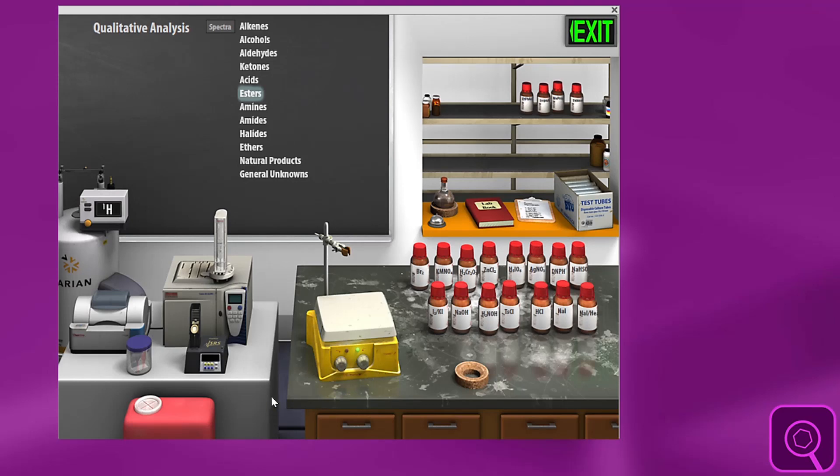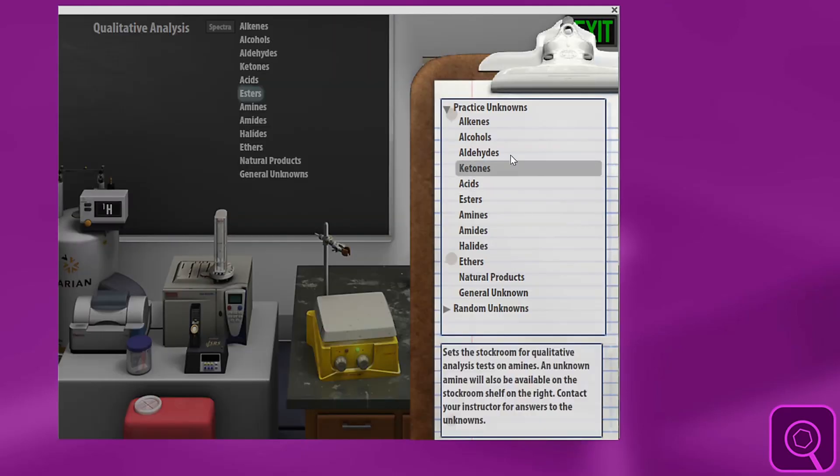Hi, I'm going to show you how to use unknowns in the organic laboratory. There are two basic ways to do it here. The clipboard allows you to pull up practice unknowns and random unknowns.